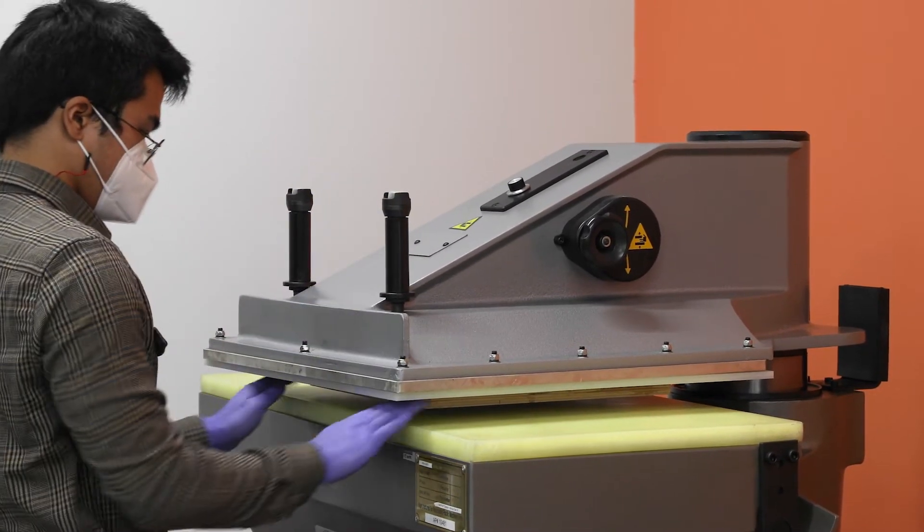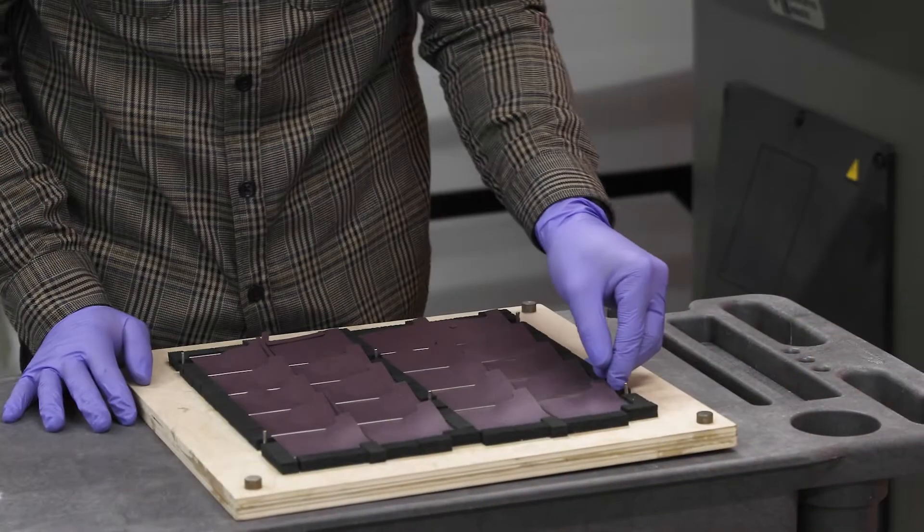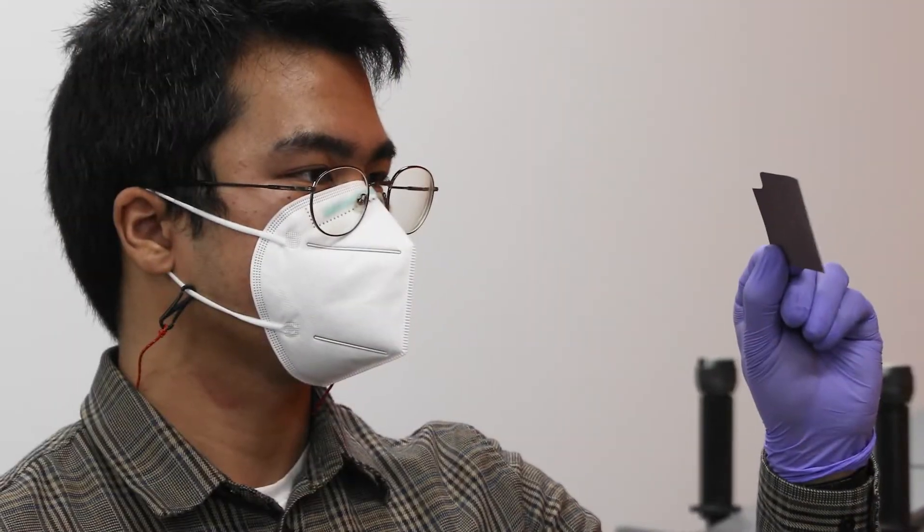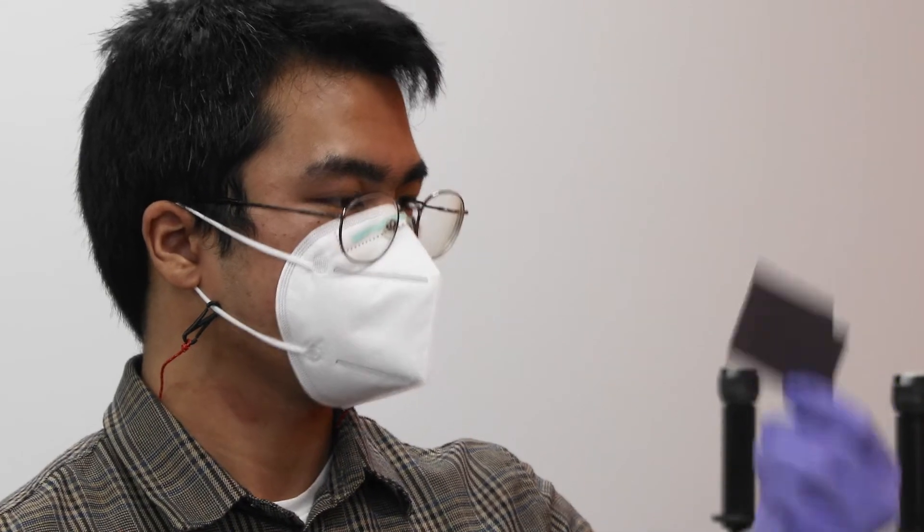Here at A-Line, we have seen it affect production by reducing the production cycle time by 50% while also increasing the final processing of parts by 500%. The kind of manufacturing we do here at A-Line is high mix, low volume.